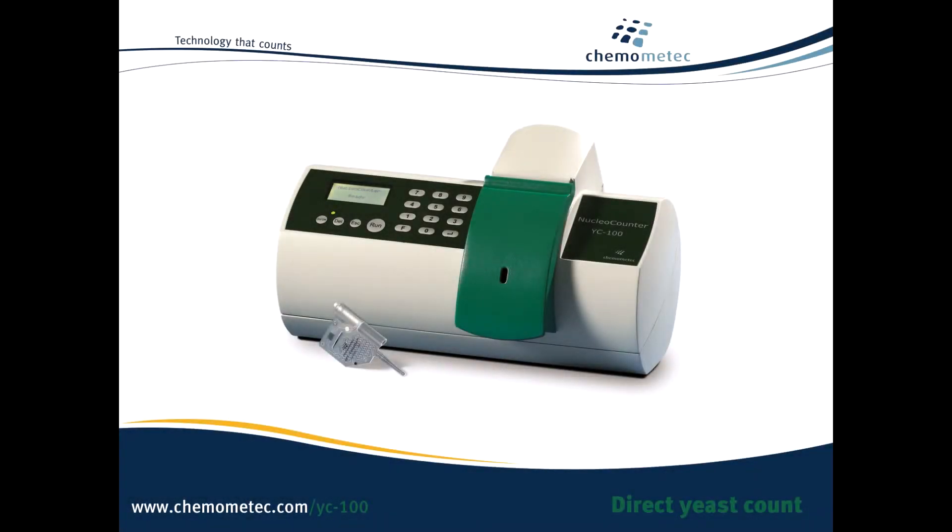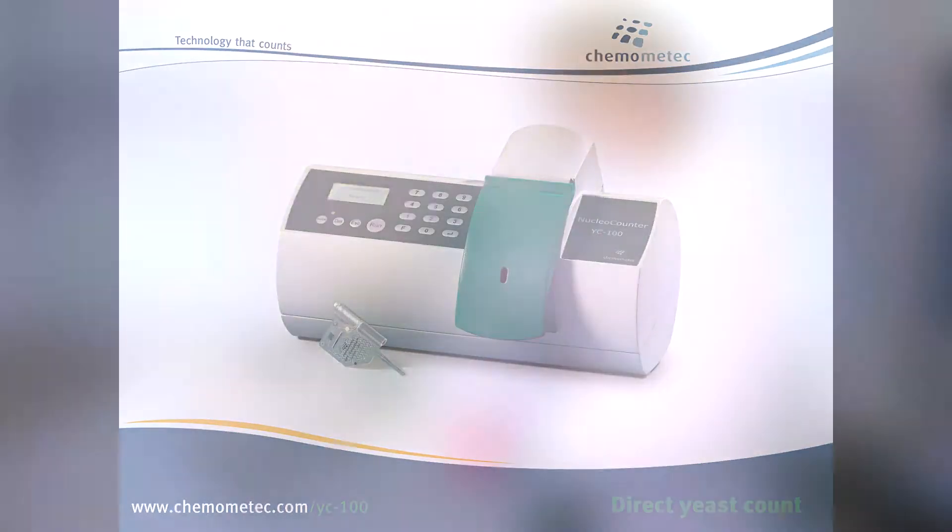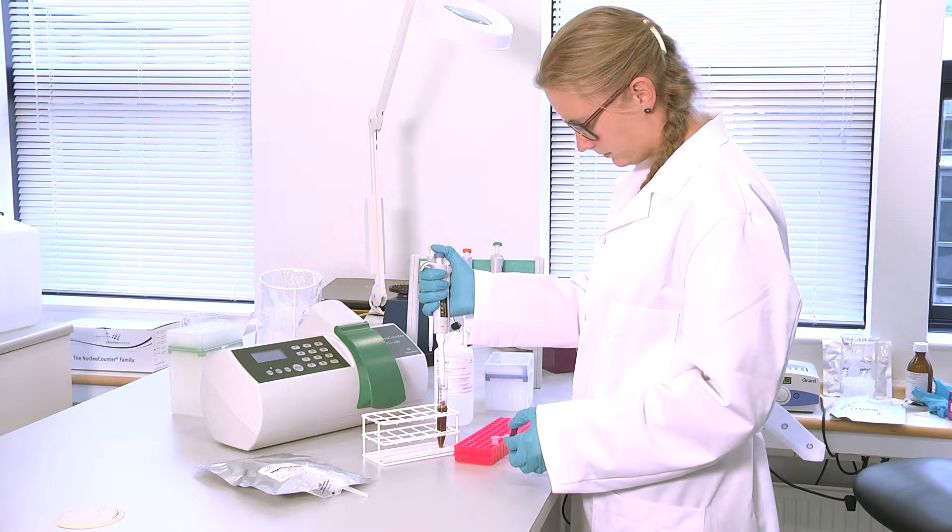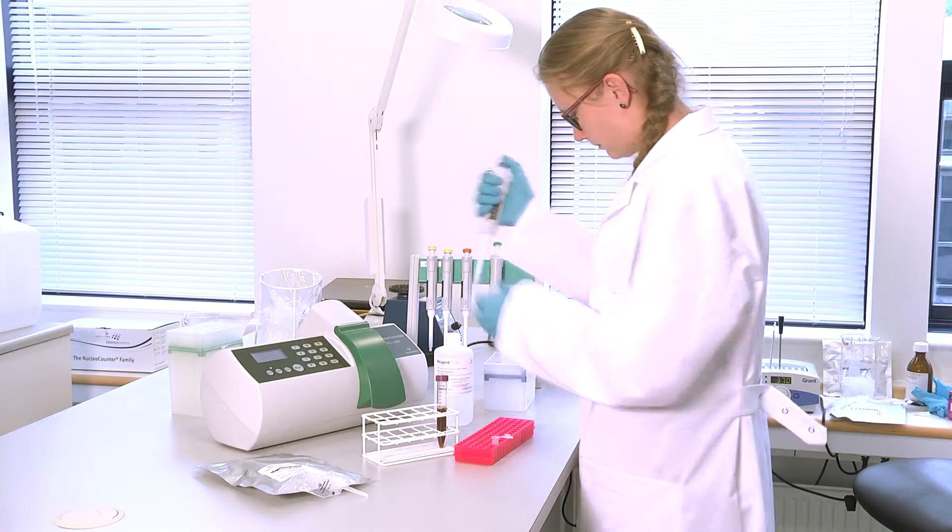The nucleocounter YC100 is the world's easiest yeast counter. It provides the total cell count in 30 seconds and measures percent viability as well.